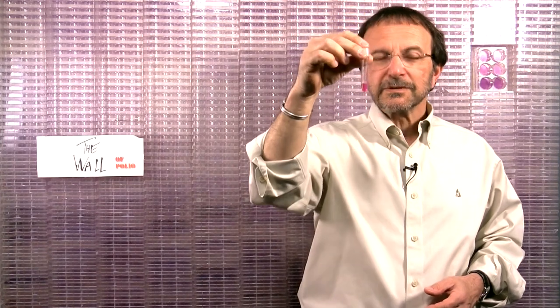If I handed you this tube and asked you to tell me how many Zika viruses were in it, what would you do? In virology, we're always measuring the number of viruses in samples. There are two general ways that we can do this.